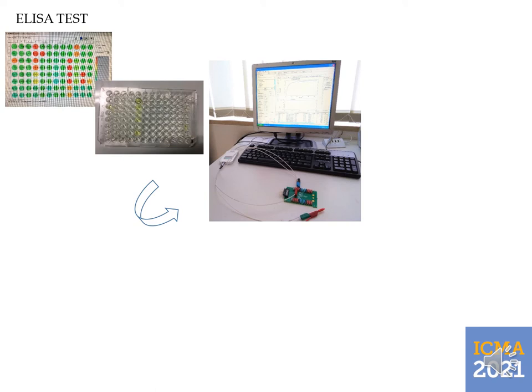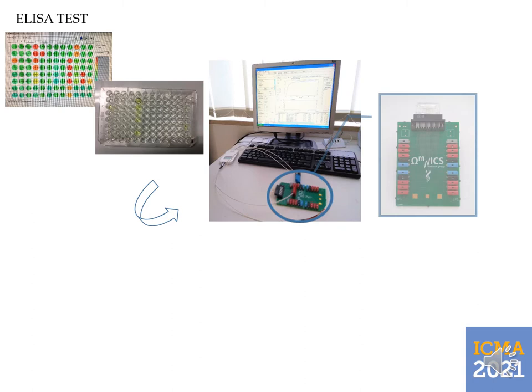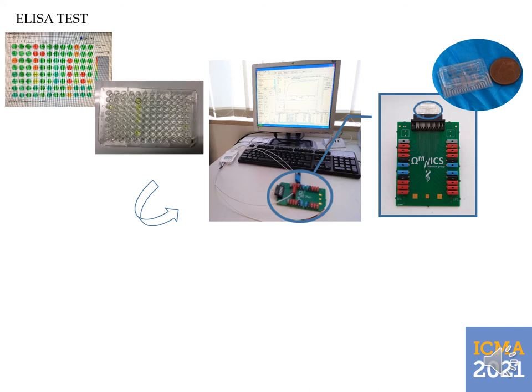Traditionally, this pathogen is detected through serological methods such as the ELISA test, but unfortunately, this technique requires time, cost, and a qualified person. Instead, a LOC can communicate with the PC thanks to the aid of a PCB platform in which it is inserted. The LOC system used for the detection includes a PDMS microfluidic model made by 4 microchambers and a central inlet hole, used to perform the functionalization step and insert the sample to be measured.